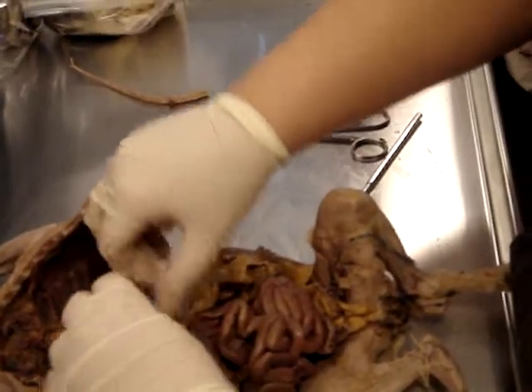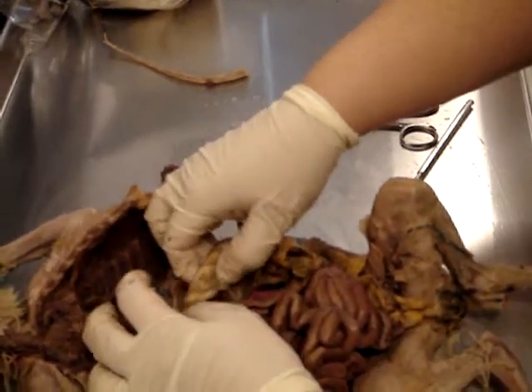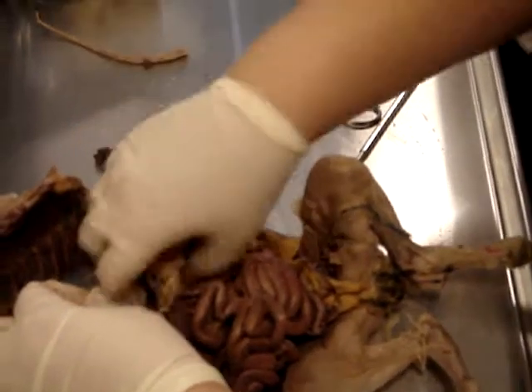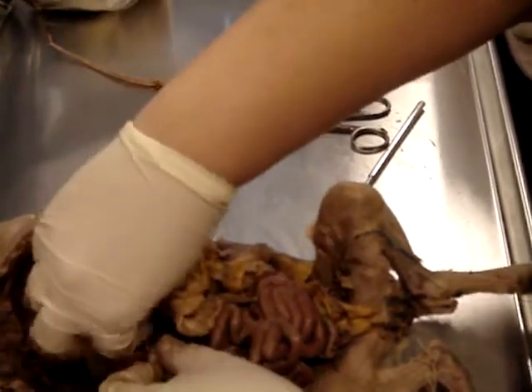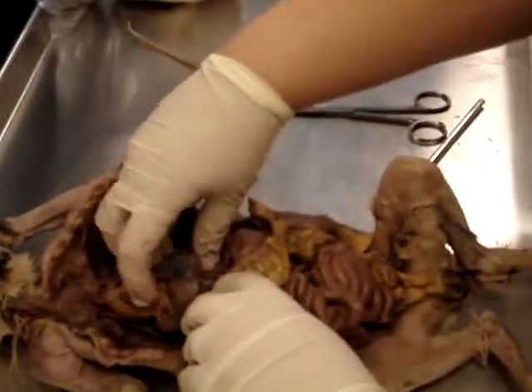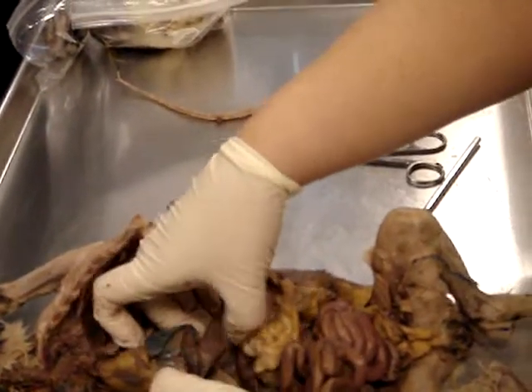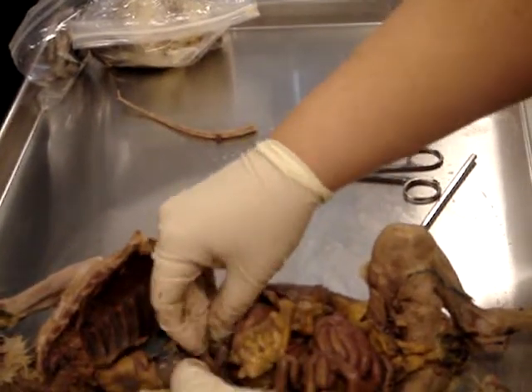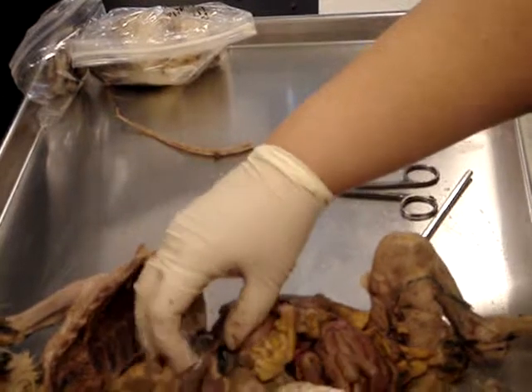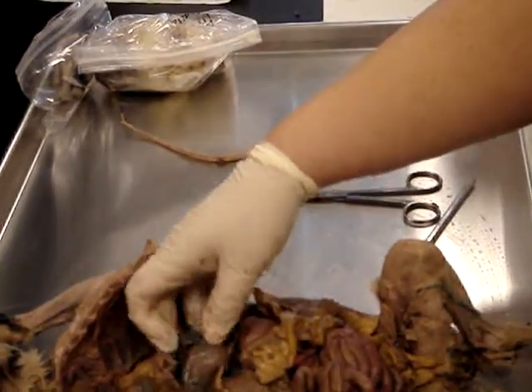So the omentum is kind of in the way. Oh, this is crazy. That's what that fat is. So I know he's got a problem because what happened is he has a hole in his diaphragm. So his omentum was sticking up through his diaphragm. What do you mean it was sticking in there? Oh, that's crazy.